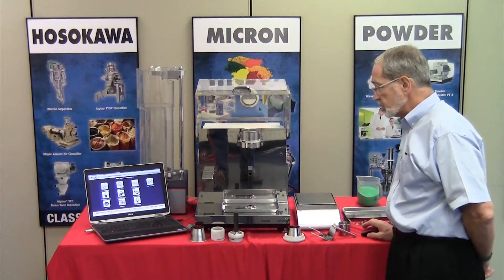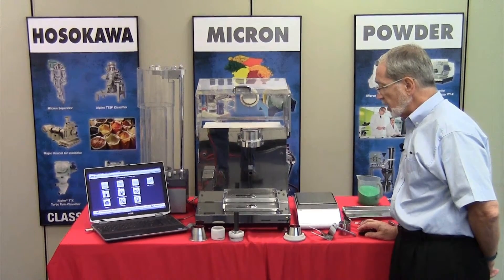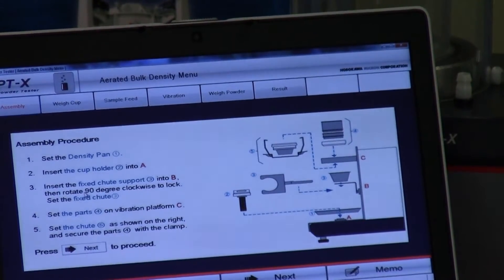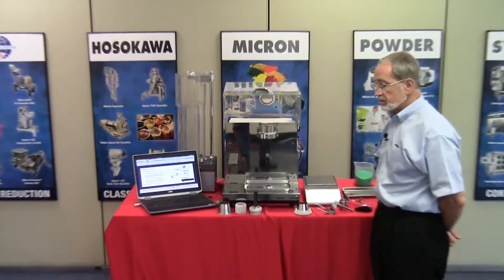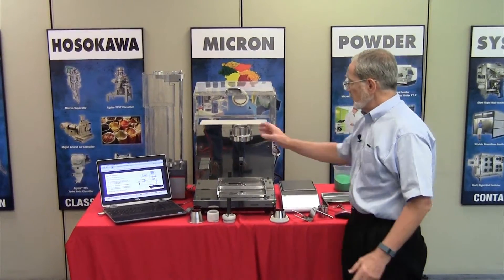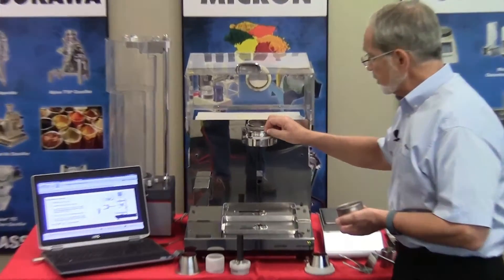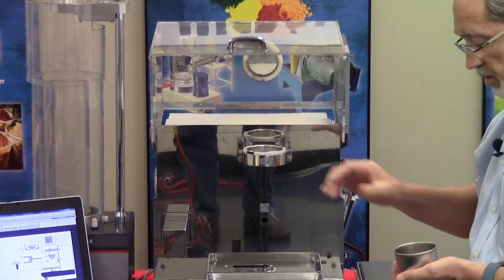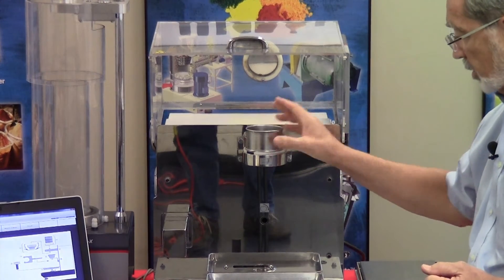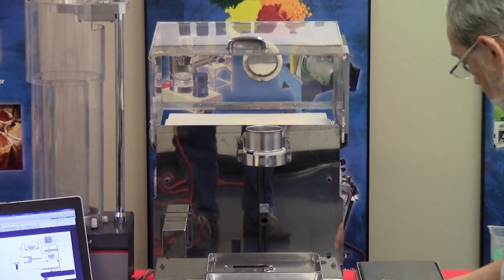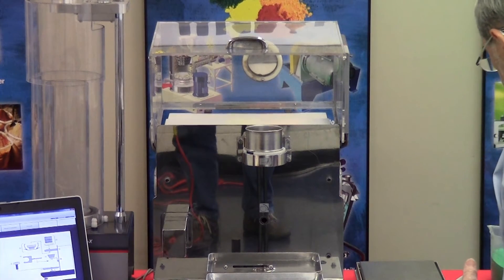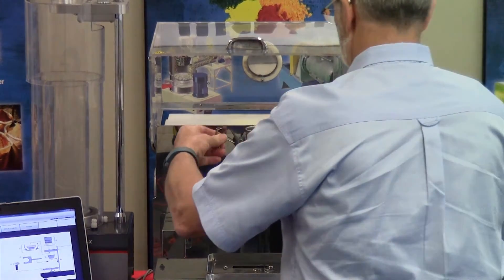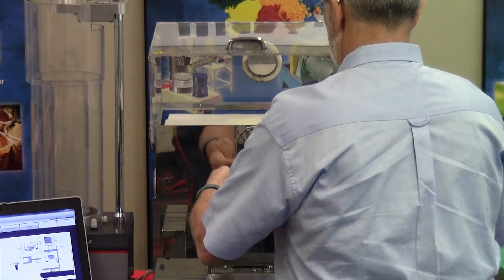Using the CAR methods and the PTX, we press the icon on the main menu, which opens a page with a diagram showing how to set the instrument in place. First, we set the sieve holding frame, then the sieve screen which is a flow control device, the cup extension, and a vibratory funnel placed within the holder, bringing the holder up and clamping it into position.